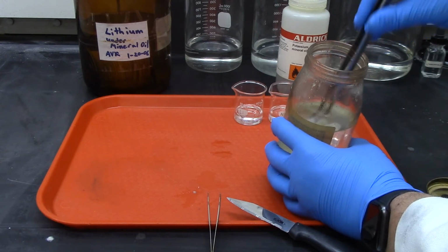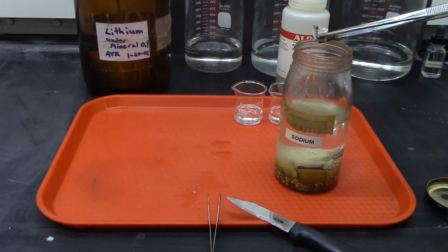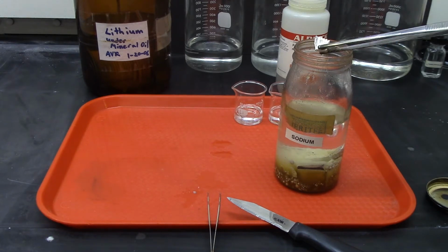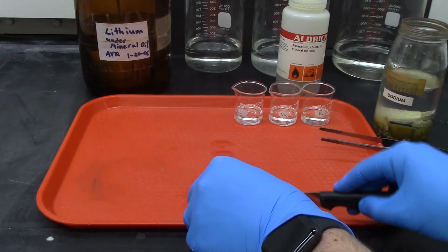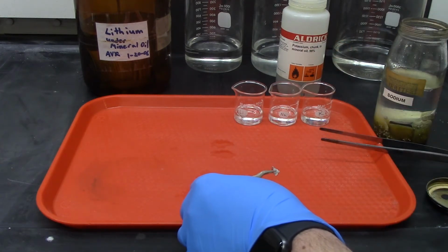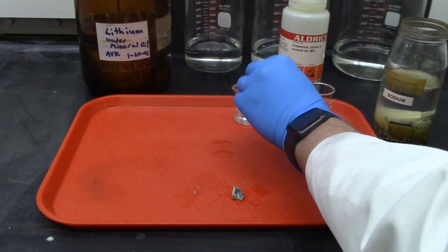This sodium is a little bit fresher than the lithium, so when I took it out there was already a pretty clean face, as you can see there. It's pretty shiny. I cut it with a knife. This is actually a very soft metal, so you don't actually even need a knife, but cut it down to a size that was appropriate for this demo.